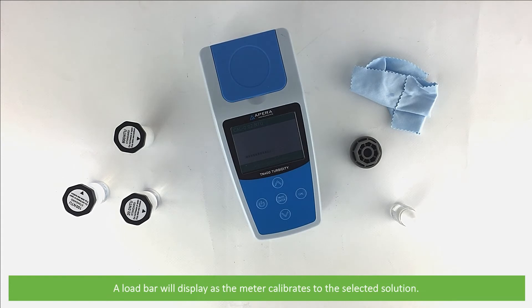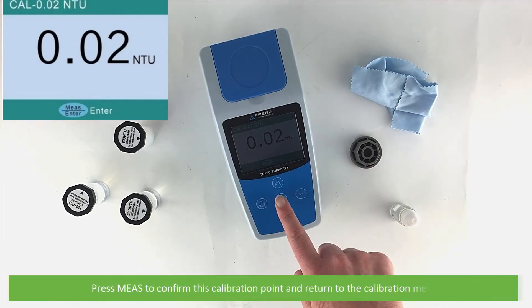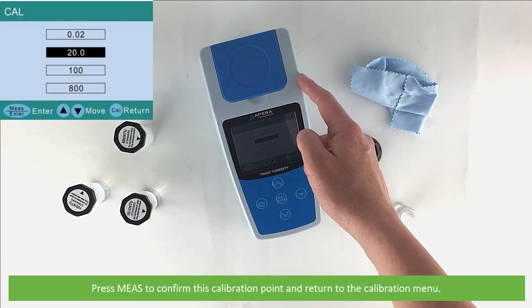A load bar will display as the meter calibrates to the selected solution. When complete, the standard solution will hold on the display. Press measure to confirm and return to the calibration menu.